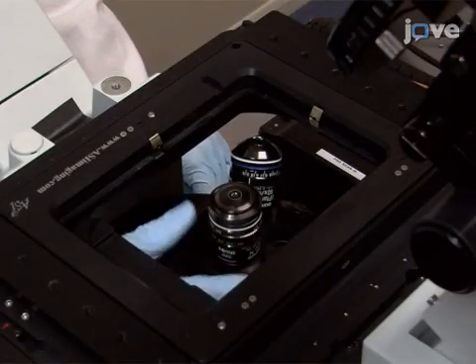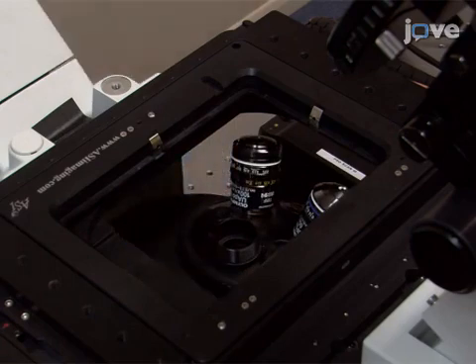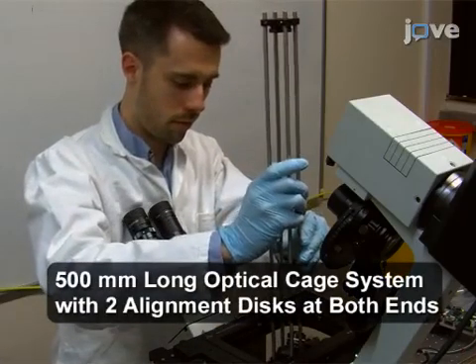Next, to accurately define the optical axis for the system, remove the objective lens OB from the turret and instead screw in an alignment tool.